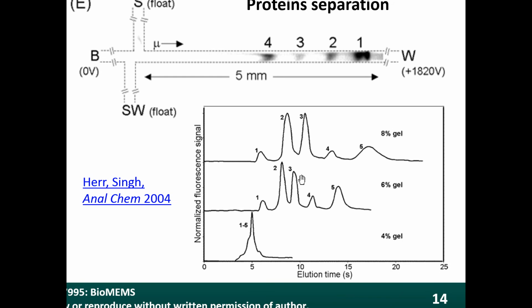Chromatograms operate in a similar manner. So these are the types of data, or the results that you get from chemical separations. Time on the x-axis, molecular quantity on the y-axis. So over time you can see that at time 0 there's nothing coming out of the system. At time 1 the smallest molecule comes out, so you get a little peak there. The next largest molecule comes out after that. So you end up having a series of peaks, and each one of these peaks represents one type of molecule that was in the mixture.